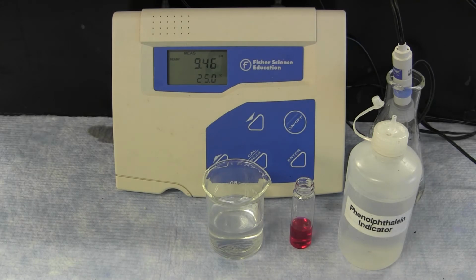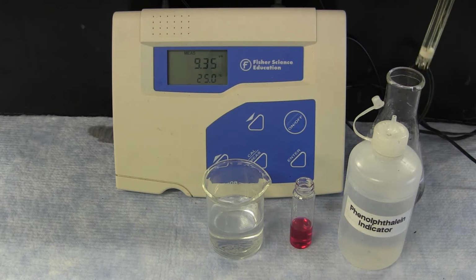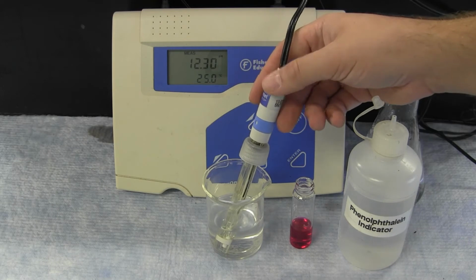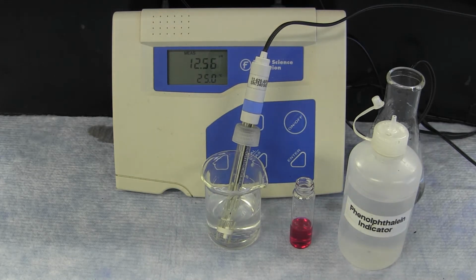While the pH indicator solution can determine that the solution in the beaker is a base, and the pH paper can indicate that the solution has a pH of 12, the pH meter can give a much more accurate measurement of the pH. pH meters take a few seconds or so to stabilize in the solution, but you can already see that this solution has a pH of 12.67 or 12.68, a much more accurate reading than just the whole number of 12 that was given by the pH paper.